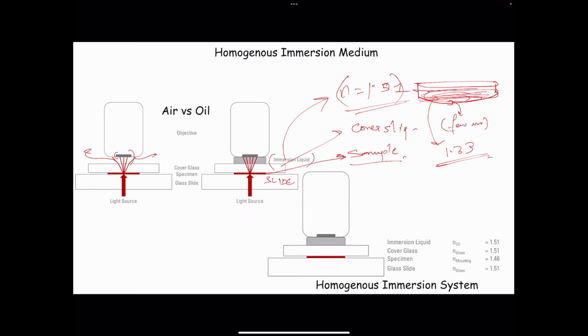Now, although the different media, such as the material of the lens, the cover slip, as well as the glass slide, are supposedly said to have a similar refractive index, it is still similar, it is not identical, because the material out of which your slide, cover slip or lens is made is fundamentally different. In addition to this, if you keep the specimen suspended in a mounting media which has an altogether very huge difference in terms of its refractive index, it is going to cause a problem.